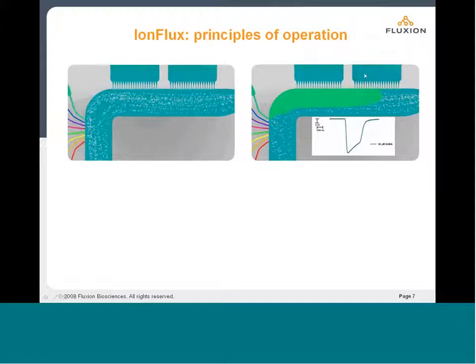So this would be a recording from one of the two traps as the solution is flowing past, exposing ligand to the cells. The channels open and current flows. In this case, we're showing a GABA current, a slight bit of desensitization. And then as soon as the solution stops, immediately a washout period starts. And this would be done for two recordings next to one another. This would be done across the entire plate.